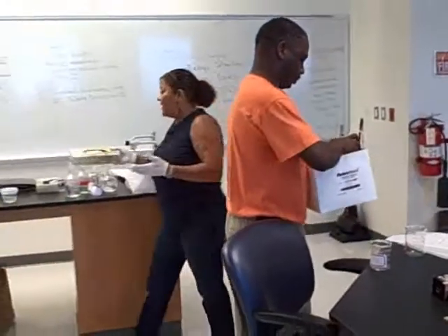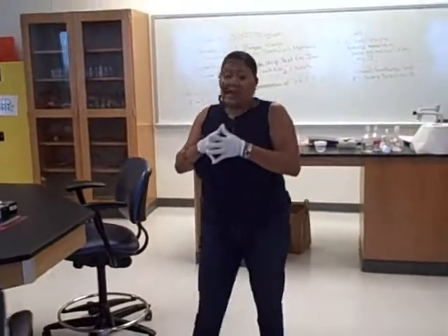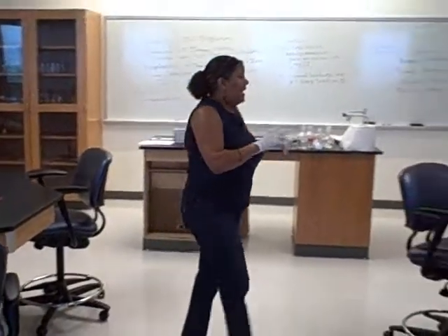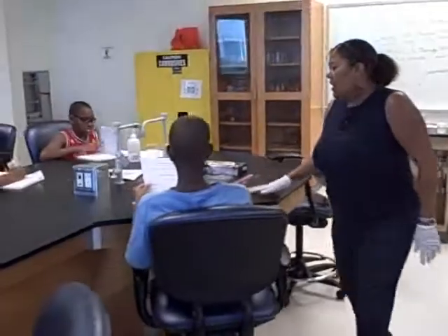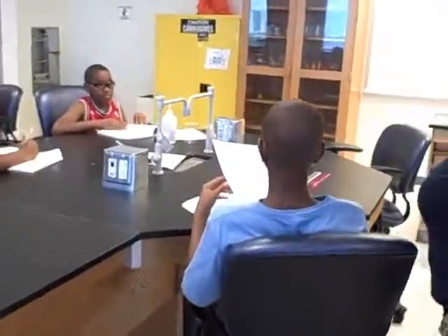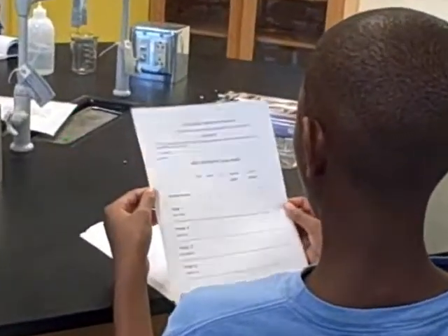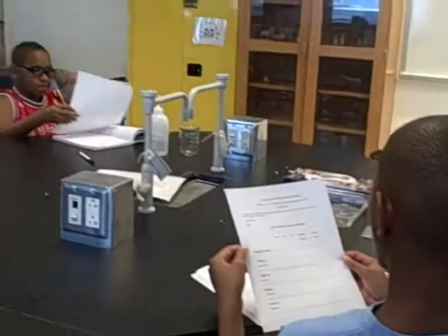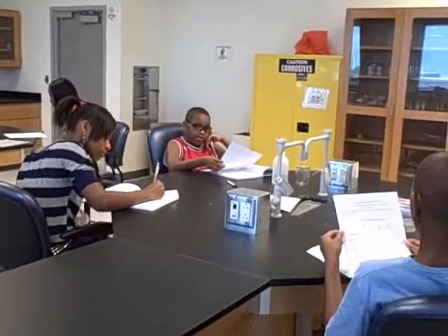Let me just briefly explain to you what we're going to do. Look at your data sheet right now. You can stop writing for a moment and look at your data sheets. The data sheet says objective: students will sample two area bayous. We did that last week, Brays Bayou and Buffalo. Today we will determine the concentration of various minerals found in this water using chemical methods.